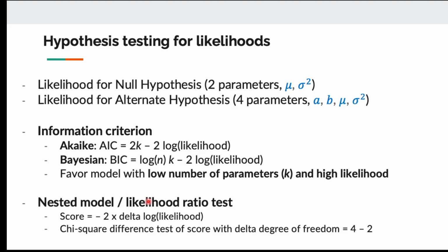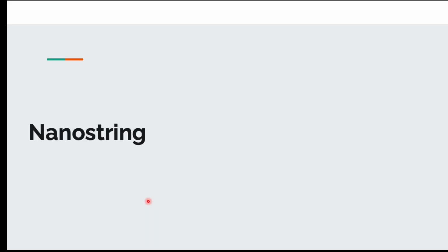what I want to talk about, the calculation that we perform to correct the noise in microarray. We're going to save the differential expression analysis for the next lecture so that it goes together with the RNA sequencing data and everything. So for today, I'm going to introduce the platform first. So after microarray, the other platform that some of you might have seen, but might be new to some of you, is called Nanostring. So this is a very new technology, but the concept is not that new.